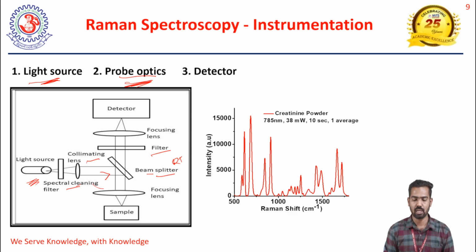That is the meaning. I will give one example. Suppose I am taking RT 50/50. What is the meaning? RT 50/50 means the beam splitter has the property that 50% of the light is reflected and the remaining is transmitted. In a similar way, we can use RT 70/30, RT 30/70. We can use various beam splitters according to your applications.